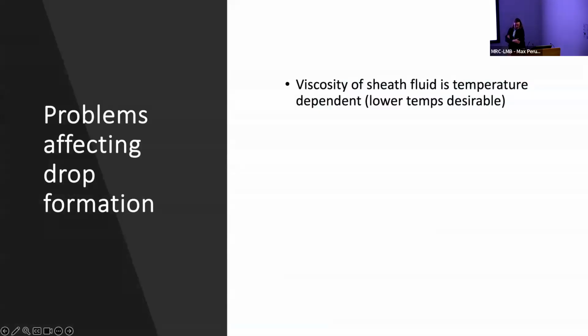And the first is the viscosity of the sheath fluid. And as I mentioned, it's temperature dependent. So that's why often in flow core labs, you'll feel quite chilly. We tend to try to keep those temperatures quite low. However, as the temperature changes throughout the day, the viscosity will slightly change. So we have to alter our settings, or not alter the settings, but double check our settings to make sure that we're still in the same spot.